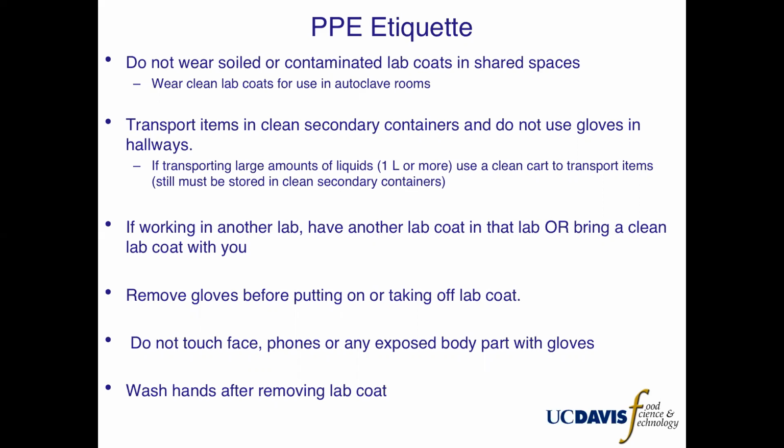If you're working in another lab, have another lab coat in that lab or bring a clean lab coat with you. This is especially important for those working with biohazardous materials. Different labs may have different hazards, and you don't want to contaminate any lab with hazards that you're working with in a different lab. Remove gloves before putting on or taking off lab coats.